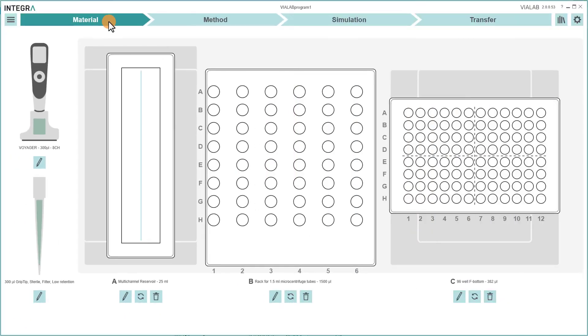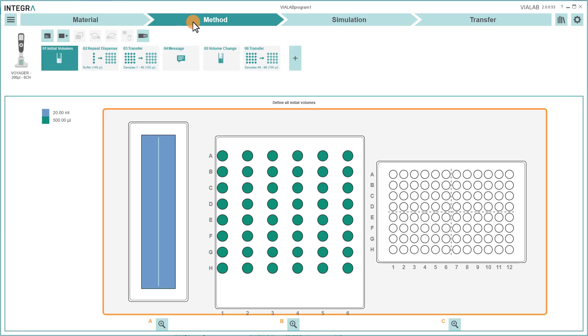Each VIALAB program is divided into four sections. In the first section, Material, you can define all your labware items used in your assay. In the section Method, you can create your pipetting tasks.